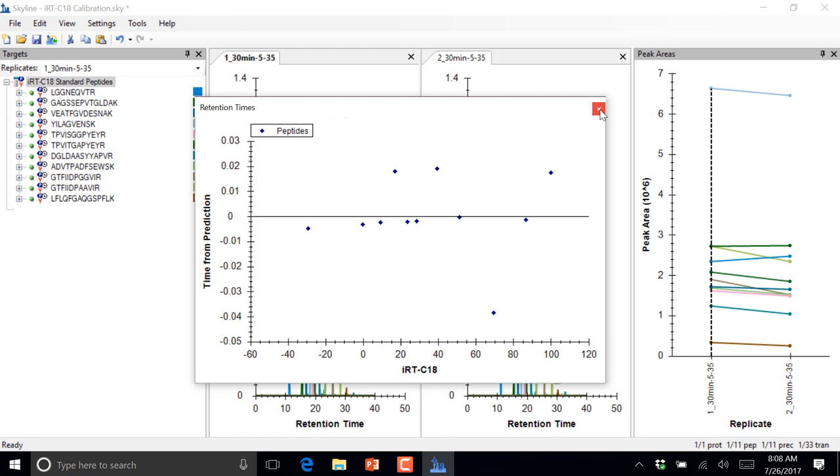Okay, go ahead. Is there any suggested number of regression runs if you want to set up a really nicely calibrated IRT? We take the median value, so maybe at least 3. I don't have experience of needing a specific number, so I can't provide a whole lot of guidance there, but I do think having more than one is probably a good idea.